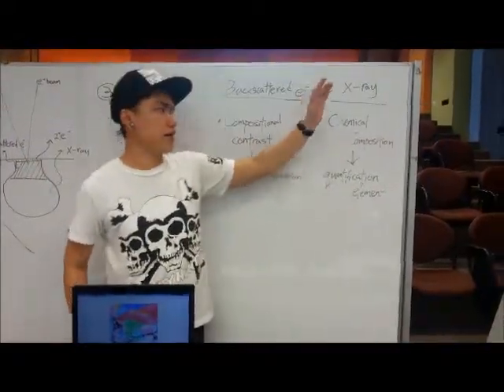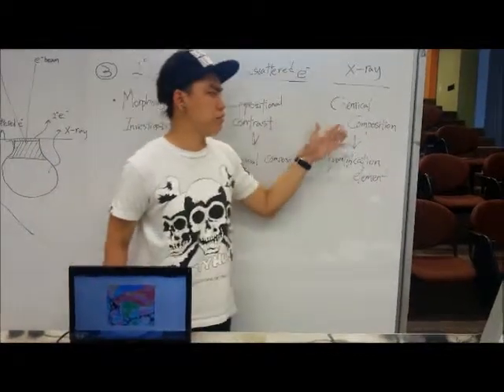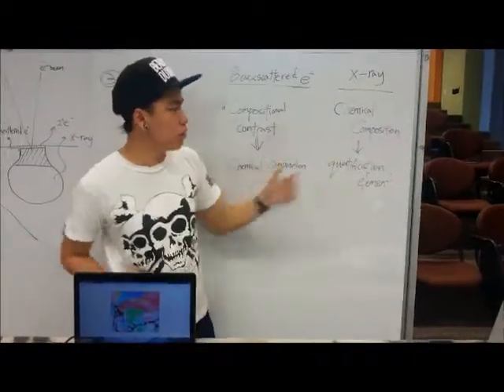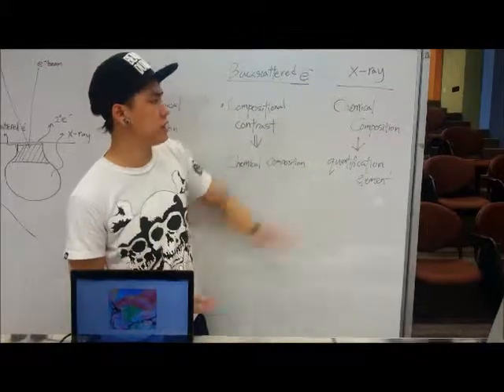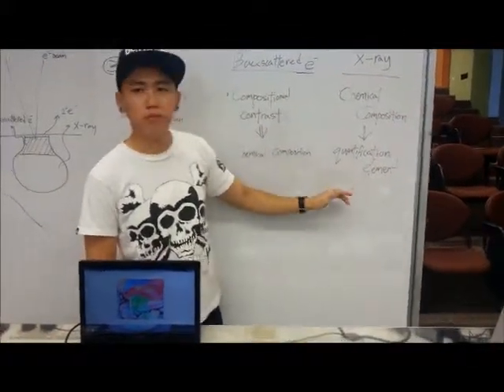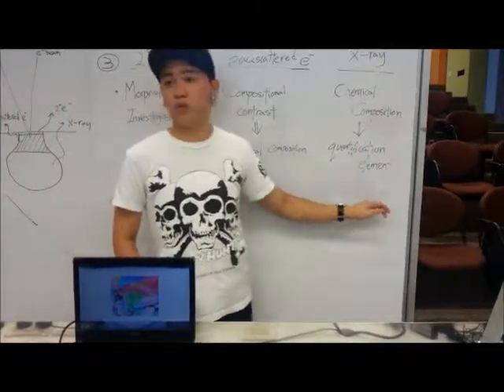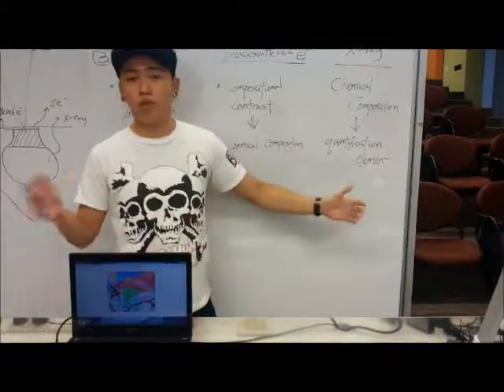Last but not least, we have X-ray. Similarly to backscatter electrons, it enables us to find out about the material's chemical composition. So what's the main difference between the two of them? It's that X-ray will enable us to find out about the quantification of elements, from boron to uranium, which is proton number 5 to 92. So as you can tell, it's a pretty wide range of elements.